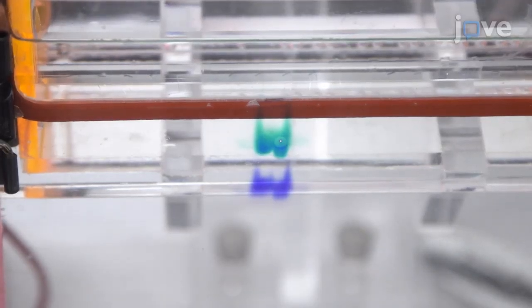It involves several steps and many details that are better demonstrated rather than explained in words. After watching this video, you should be comfortable with how to prepare a random library, synthesize a starting RNA pool, and perform a binding reaction to separate desired and undesired molecules to obtain high affinity and specific binders.